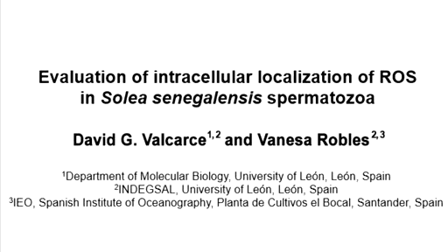The overall goal of this experiment is to evaluate the intracellular location of reactive oxygen species within Solea senegalensis spermatozoa by confocal microscopy.